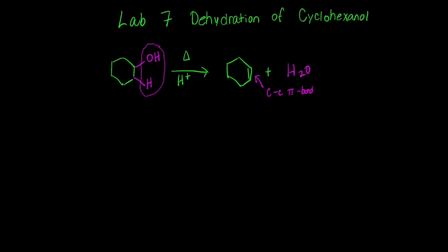Okay. Strong acid catalysts like sulfuric acid are normally used, which is non-volatile. That has a very high boiling point, and so it does not evaporate. We're going to use phosphoric acid, which is a much less acidic acid, but it's much less hazardous, and also it has a very high boiling point, so when we boil the reaction mixture, it won't escape.